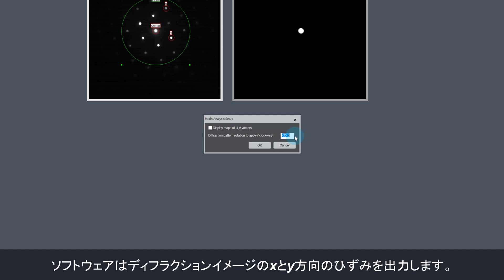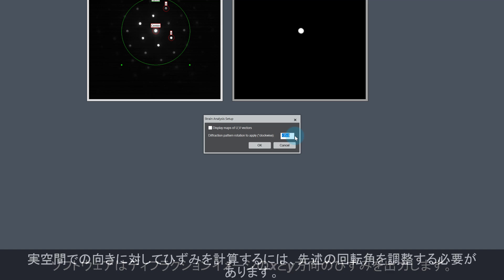The software outputs strains in the x-y directions of the diffraction image, while we are typically interested in the strain in real space directions. The same is happening in our example here. The growth direction, which we identified as V, is 35 degrees offset from the x-direction in the diffraction image.